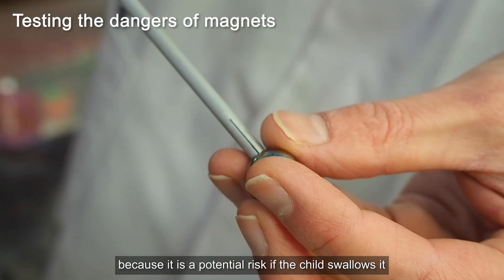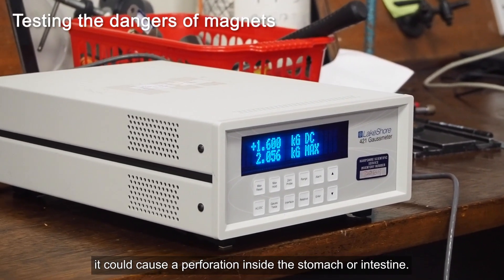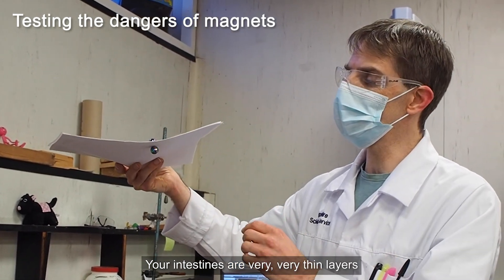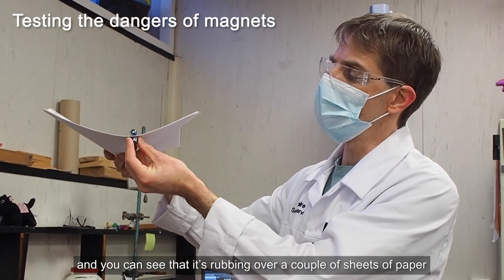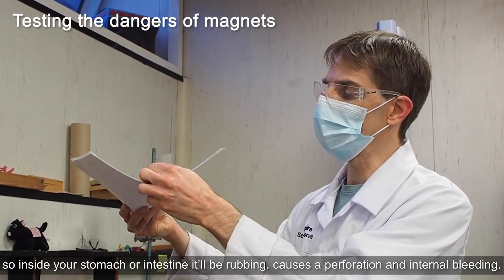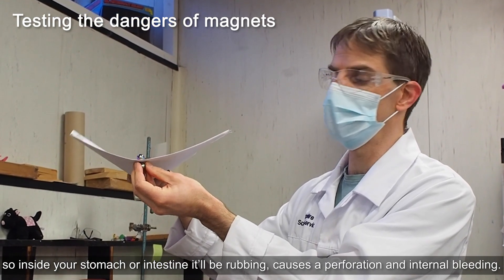This is a potential risk — if the child swallows it, it could cause a perforation inside the stomach or intestine. Your intestines are very thin layers, and you can see it rubbing over a couple of sheets of paper. Inside your stomach or intestine it would be rubbing, causing a perforation and internal bleeding.